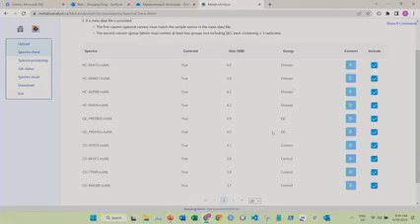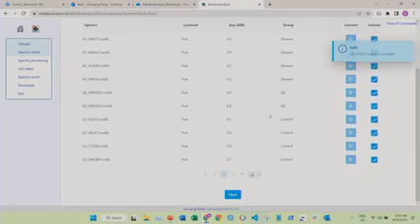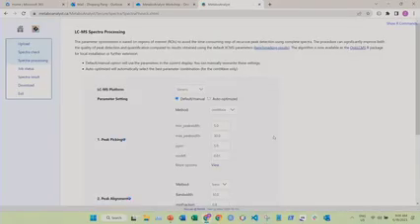But here all data have been centroid, so this is disabled. You can also select different files. If you don't want to include them for further processing, you just click it and it's going to be excluded. But here I want to include all of them. So in this step, we can click next to go into the parameter setting page.